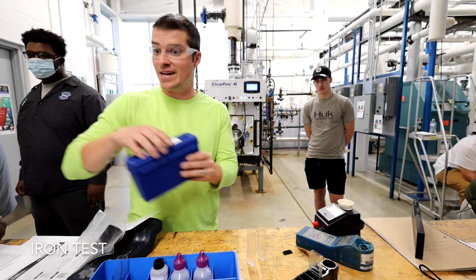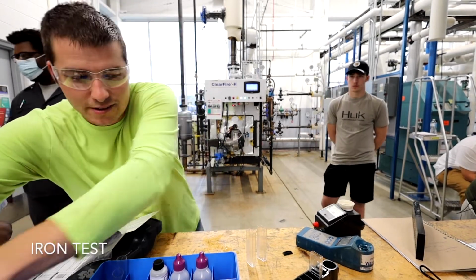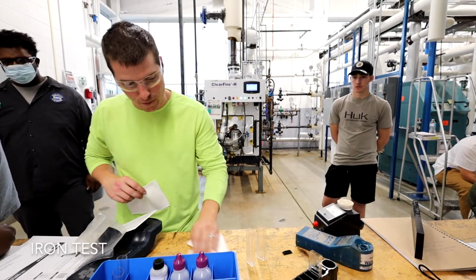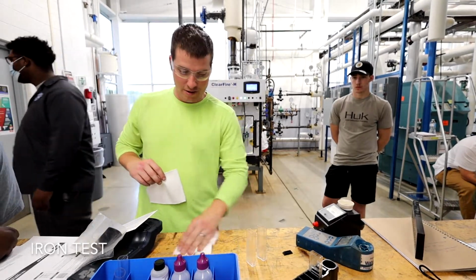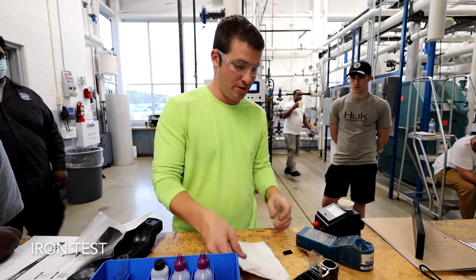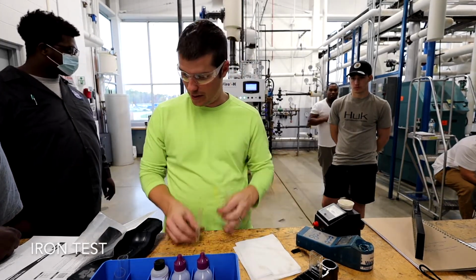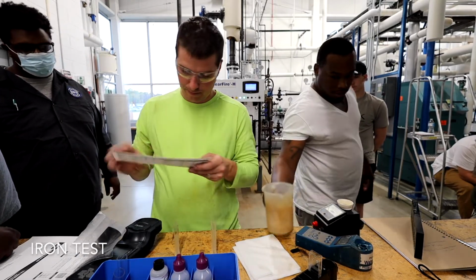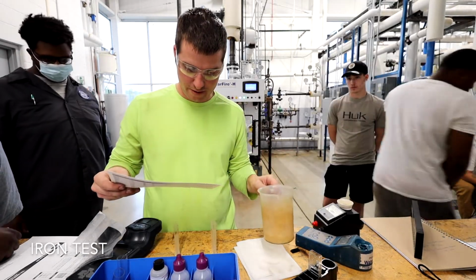And this, we actually have a nice testing area here compared to some places you go, where you're in this dark, dingy boiler room. It's not lit well. You know, I'm putting it on top of an old dirty drum or something. So this is actually nice to have, a nice workbench to be able to do this. Thank you very much. Perfect.